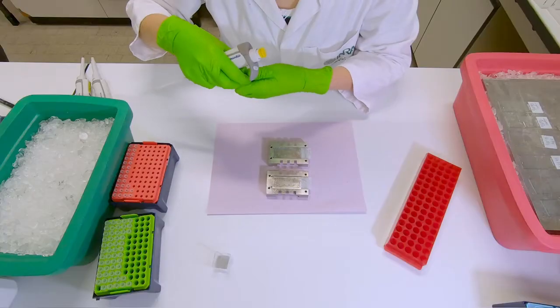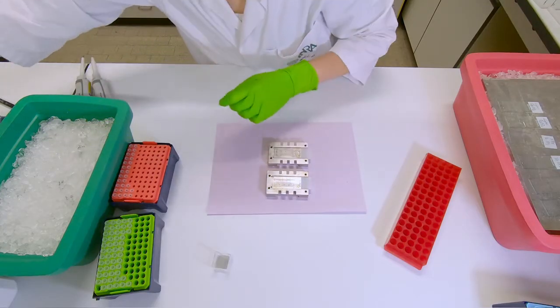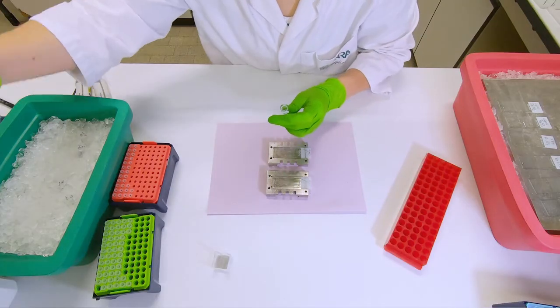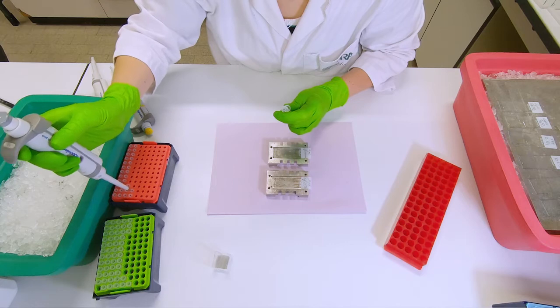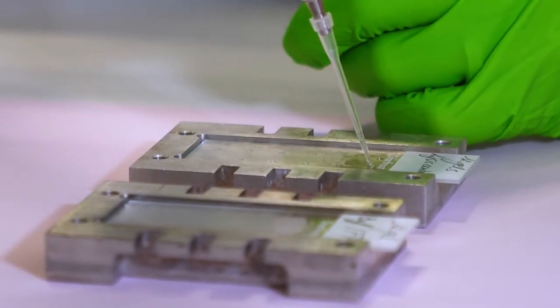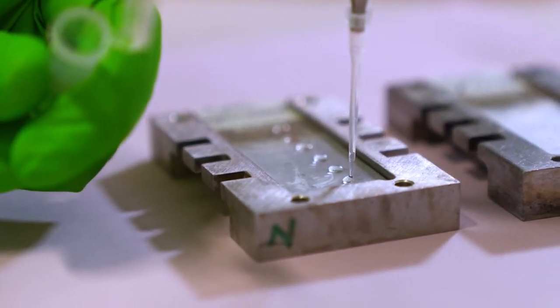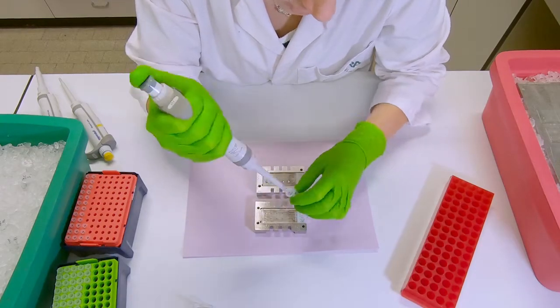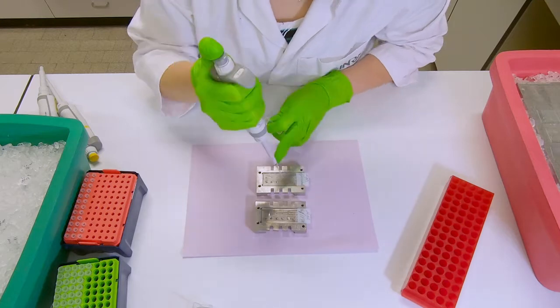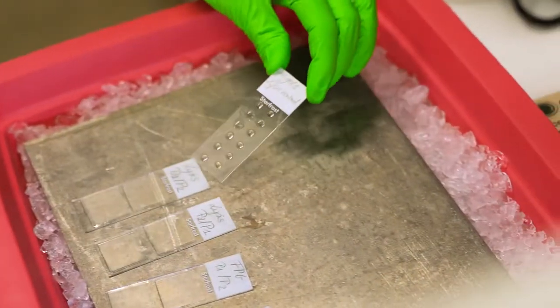Mix the cells with about 1% agarose to a final concentration of 0.7%, and then place 12 drops of 5 microliters of the mix in each glass slide. In this case, a cover slip will not be used and the shape of the gel will be a dome. One should be careful with the concentration of the cells to avoid overlapping of the comets. Whenever one slide is finished, just transfer it to a cold metal plate.